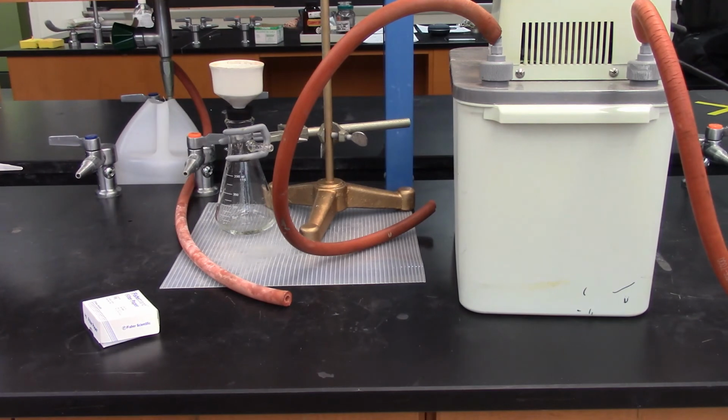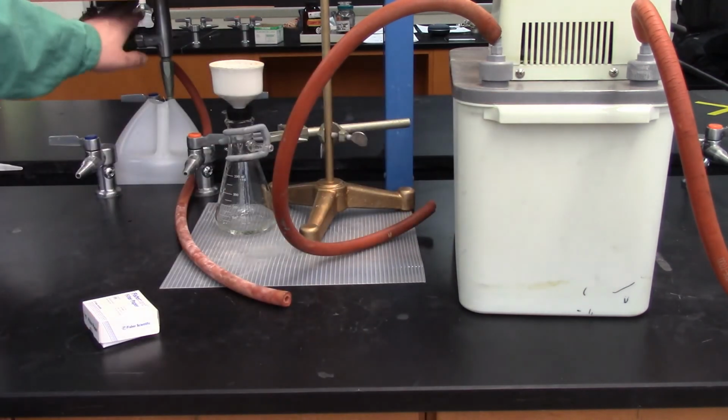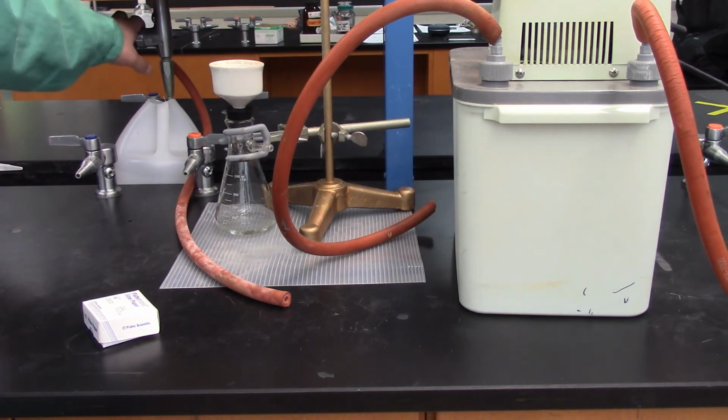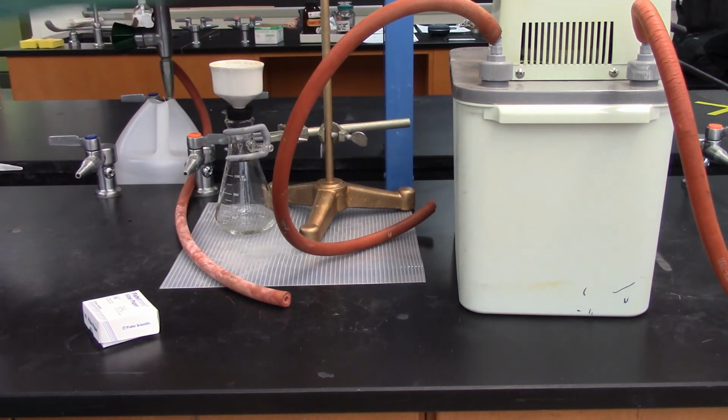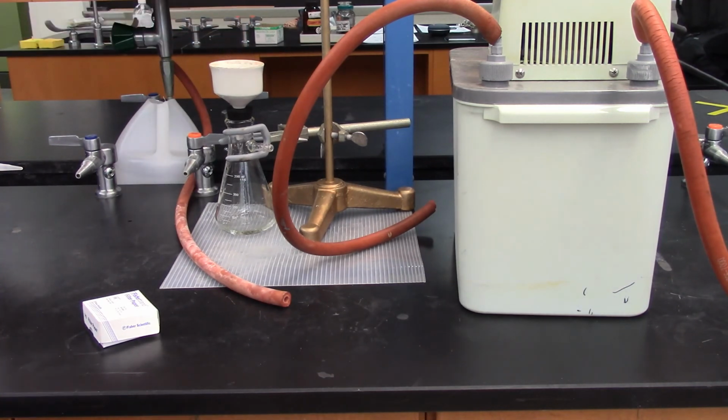Okay, so that's the technique for using vacuum filtration, whether the aspirator that's power sourced or from our sink. We try not to use the sink one because we waste a ton of water, whereas here we're just using simple electricity to get that power source. So remember to vent, remember to rinse your filter paper with some water to glue it down, and be mindful of what you're collecting during whichever step of the filtration.